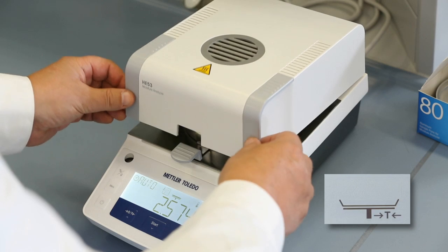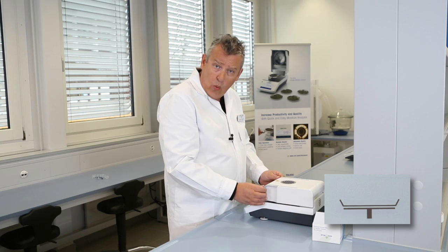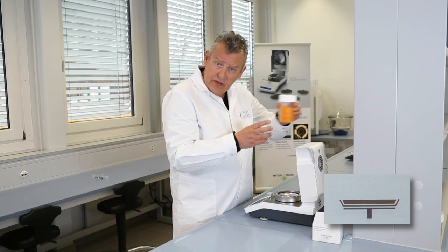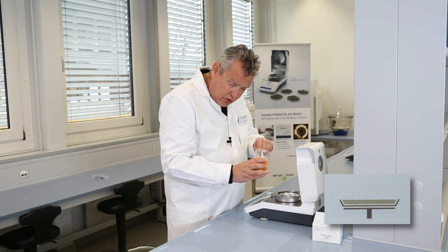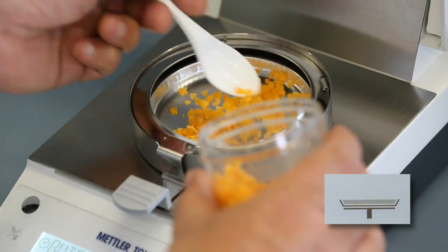Now we need to tare the empty pan. We now open the lid, take our sample, and we need to weigh in and distribute the sample on the aluminium sample pan.